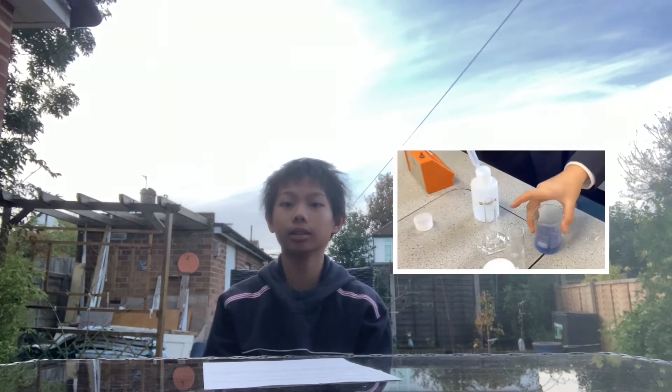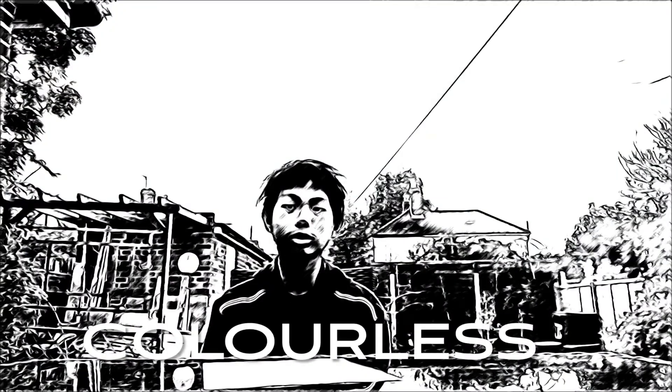Welcome back again to the L'Optics. Today we will perform a chemical reaction which turns a beaker mixture from colourless to dark blue.